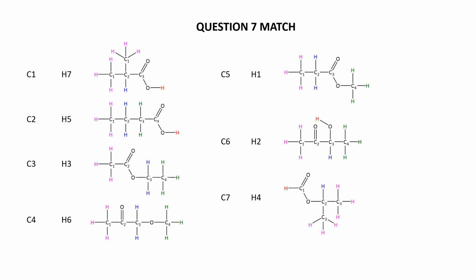So let's celebrate by concluding both the proton and the carbon assignments there. Definitely a fun little assignment for you. Hopefully you understood it. I would say that's about as sneaky as you're going to get with NMR assignments for quite a while, if not your entire university career.